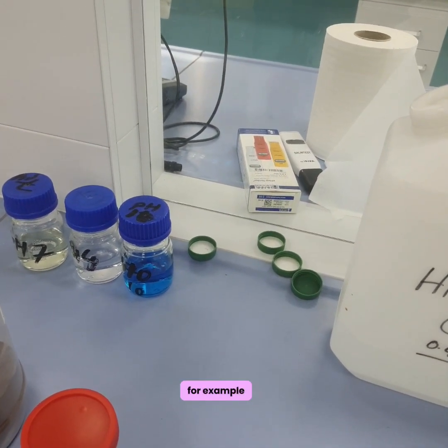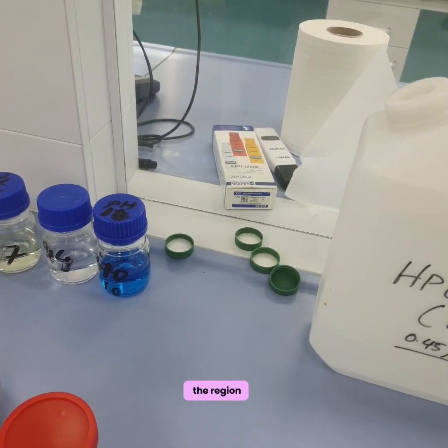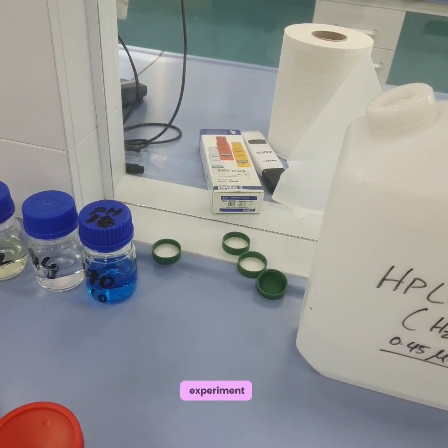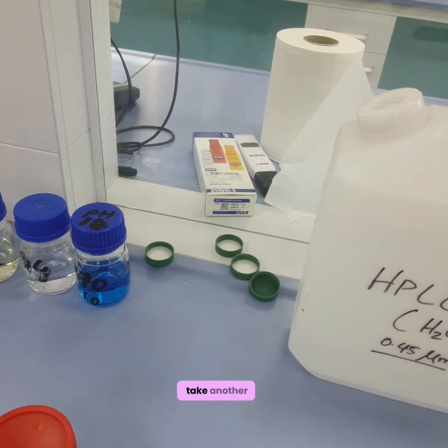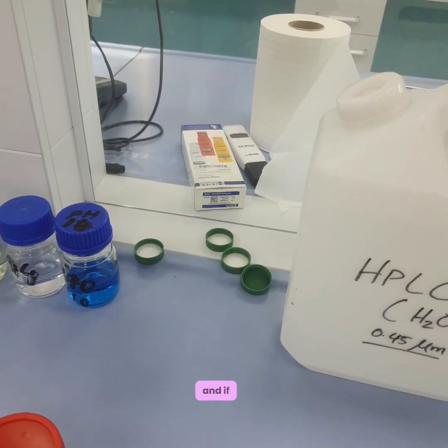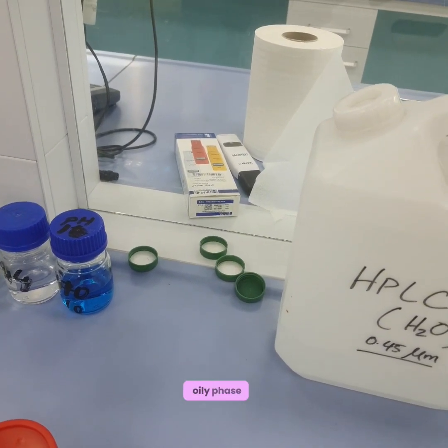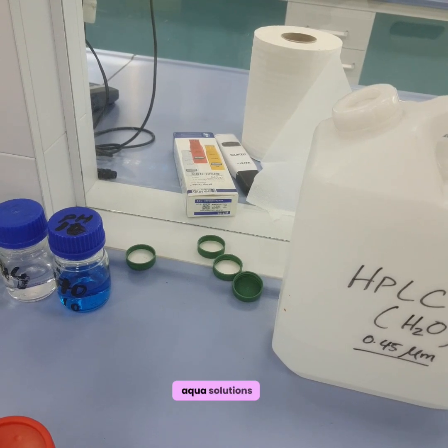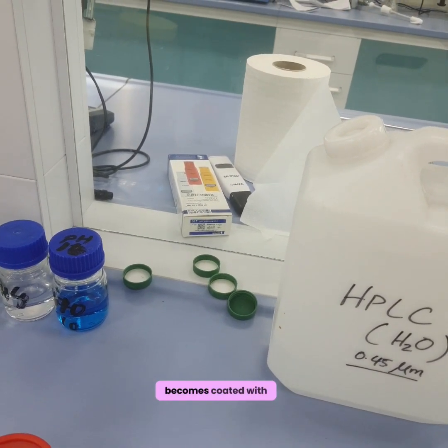For example, if the waste is hygroscopic and it absorbs the reagent water, then we can begin the experiment again using 20 gram of waste and take another amount of reagent water. And if the supernatant is multiphasic, then we can decant the oily phase and measure the pH of the aqueous solution. Also the electrode needs to be thoroughly cleaned if it becomes coated with the oily material.